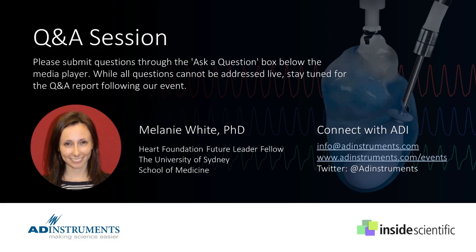I mean, if you're worried about increased pressure and there not being sufficient effluent, consider something like heparin if it's not already being used. There could be small blood clots that could be artificially elevating that perfusion pressure without actually allowing for appropriate perfusion of the coronary bed. There could be multiple things happening.